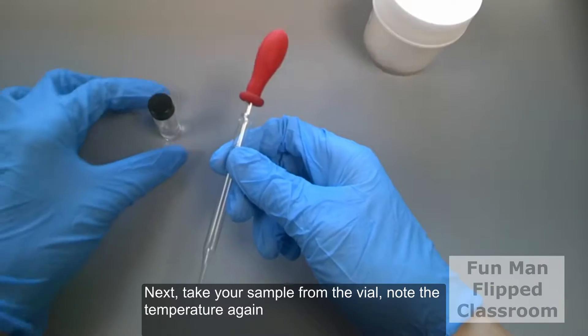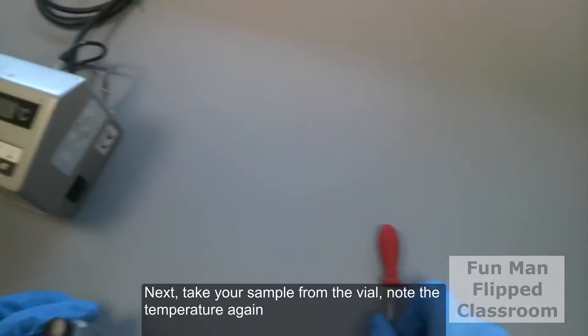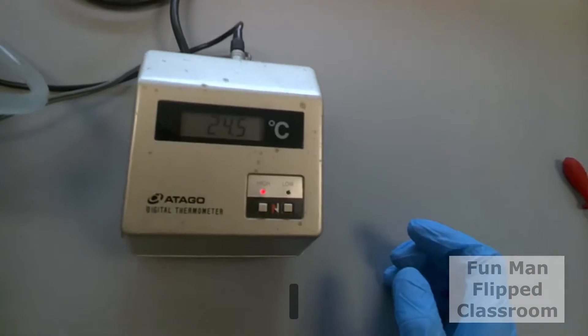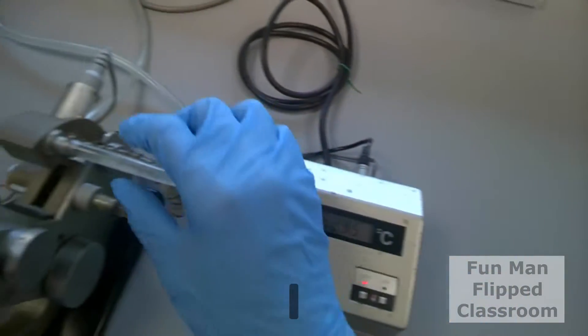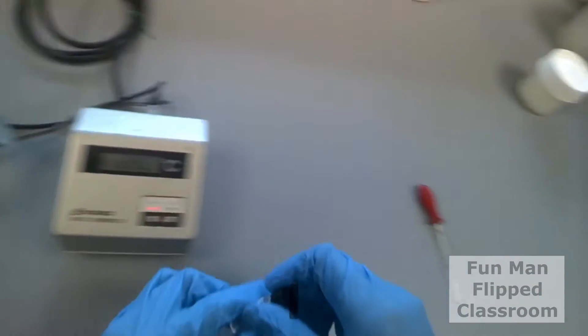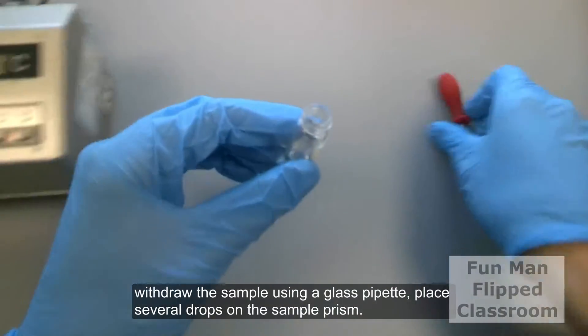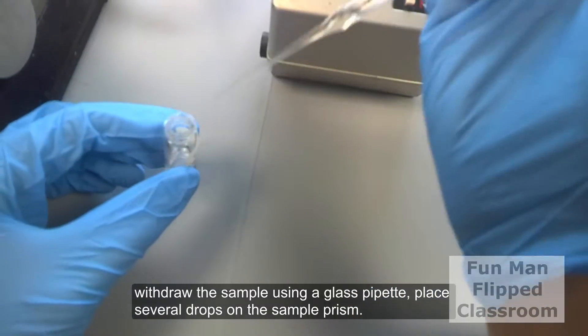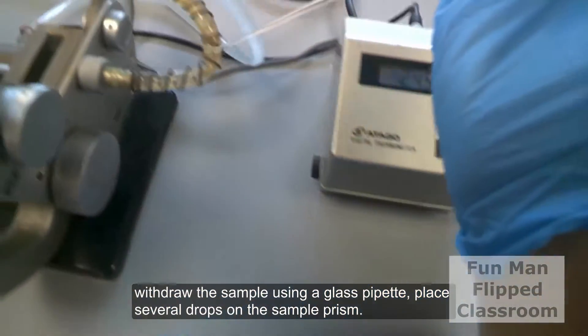Next, take your sample from the vial. Note the temperature again. And withdraw the sample using a glass pipette. Place several drops onto the sample prism.